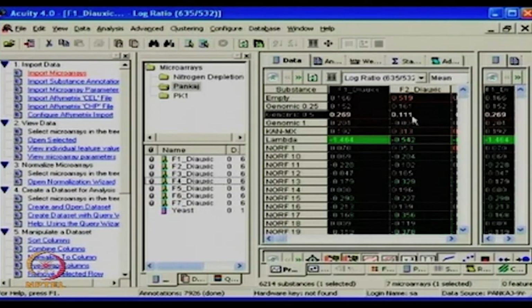Correct. So the black color is towards 1. The meaning is, when I am looking at the data, you expect that when the green and red channels both give the same intensities, it becomes blackish in color. If they are upregulated, people put them towards the red color, and if it is down regulated, a minus sign will be given and that will become down regulated.